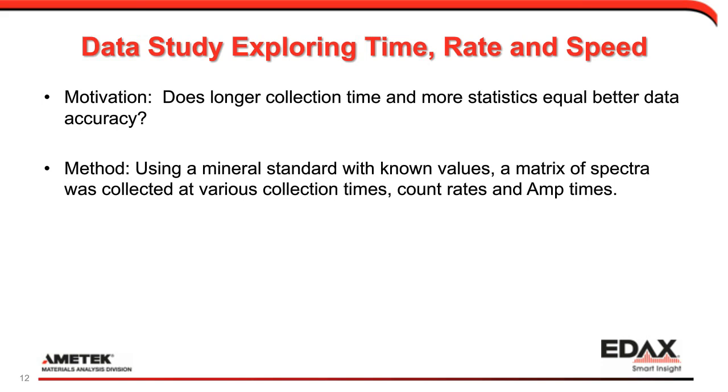One of the things to think about is early on, the dead times that we would traditionally use would be dependent upon the process time. This is also known as amp time, and so you'll hear me talk about process time and the word amp time. Those are interchangeable values that describe how quickly we process an X-ray count when it hits the detector. And that was one of the questions that we received just a little while ago, so I wanted to make sure that I answered that straight away.